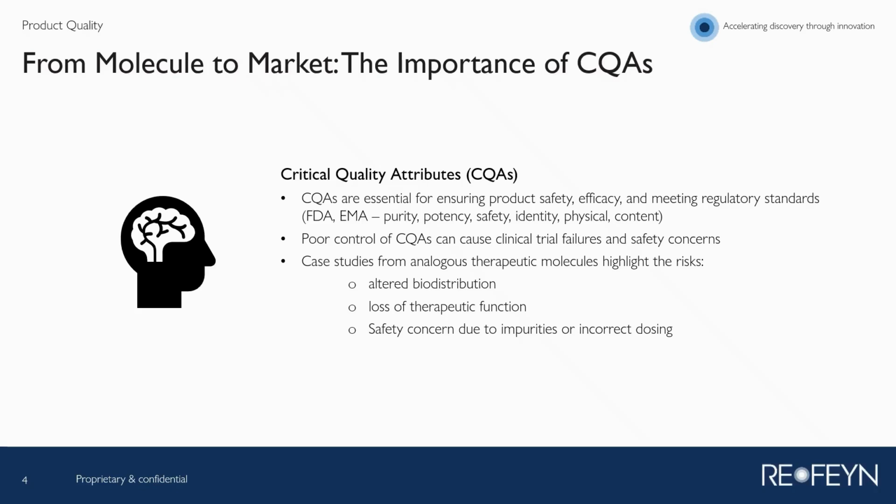Here are some of the risks associated with poor control of CQAs, and these have been taken from case studies of analogous therapeutic molecules. And they include modified biodistribution, loss of therapeutic function of the product, and finally heightened safety concerns due to the presence of impurities and/or incorrect dosing.